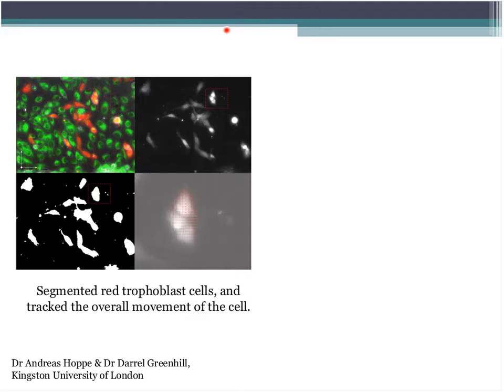We wanted to look at cell migration in terms of how it was moving relative to the media flow in the BioFlux channel. So we assigned compass directions to the cell movement from 0 round to 360. So 0 is moving in the direction of flow, and 180 is directly retrograde to flow. We split up our analysis, if you think of the compass in two semicircles, into those moving with flow, so 0 degrees and 90 either side of that, and those moving retrograde to flow, so 180 degrees and 90 either side of that.